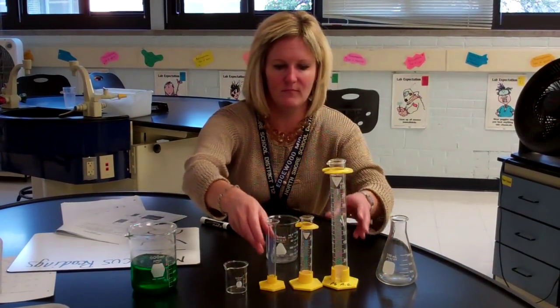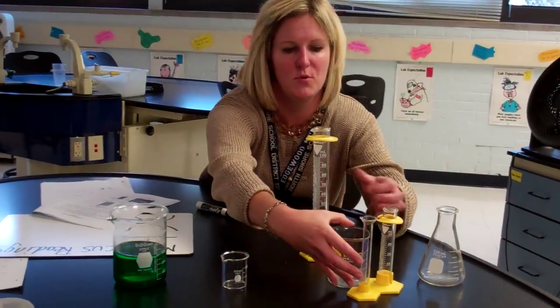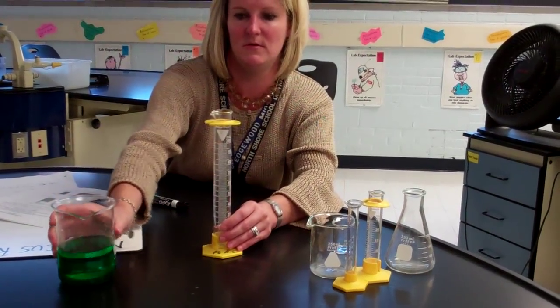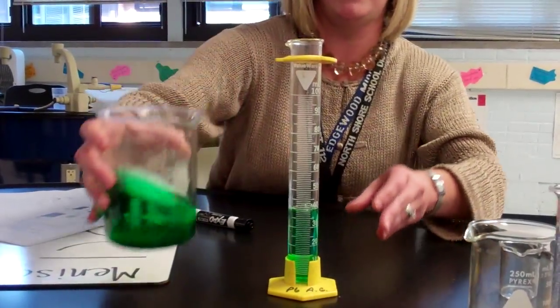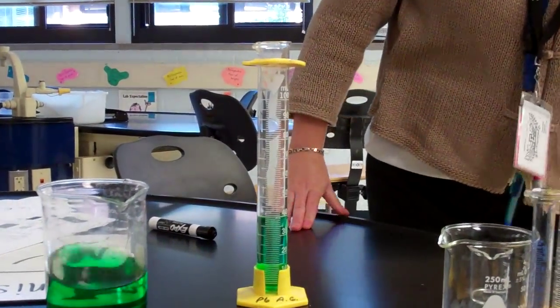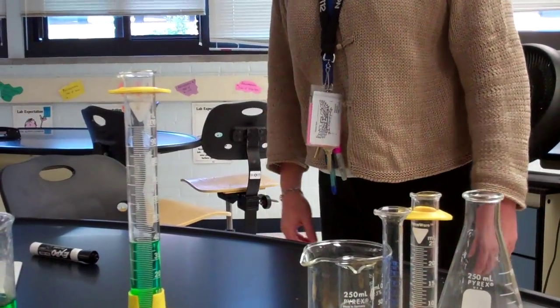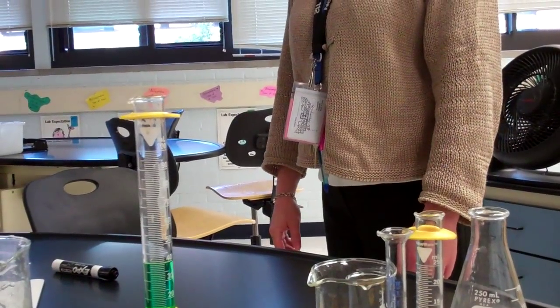To get a measurement, let's say that I am going to pour the green water into this graduated cylinder. And let's say that I do this and I say, oh, Mrs. Ryan, I think it's about maybe 40 milliliters. But Mrs. Tracy, you should always measure at eye level.